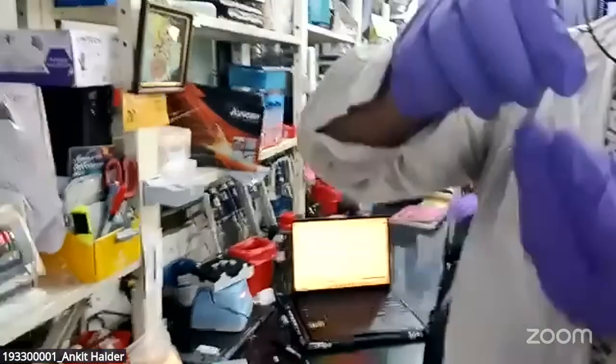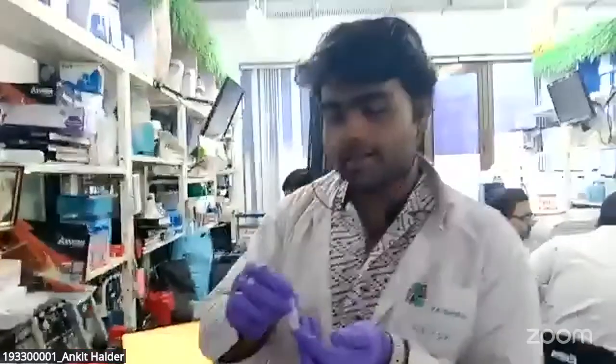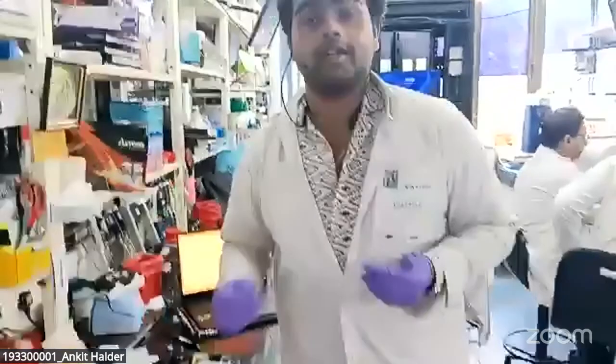Now here you can see the lysates that we prepared in the last day, and these are the proteins that are available in the lysates. The very first thing is that whenever you are going to start the digestion, you need to understand how much protein you need to first digest.